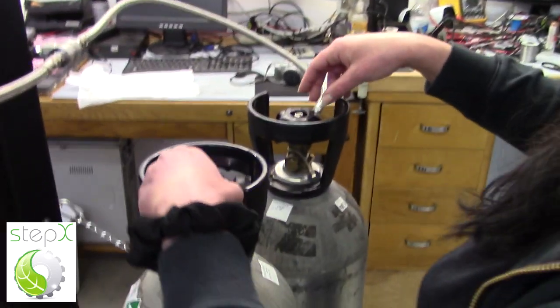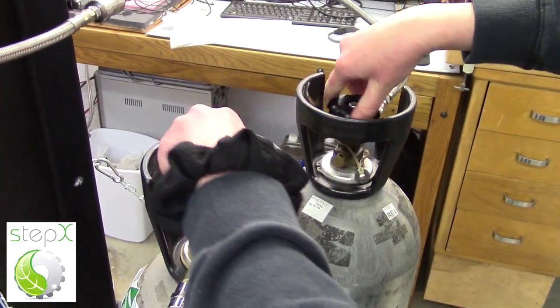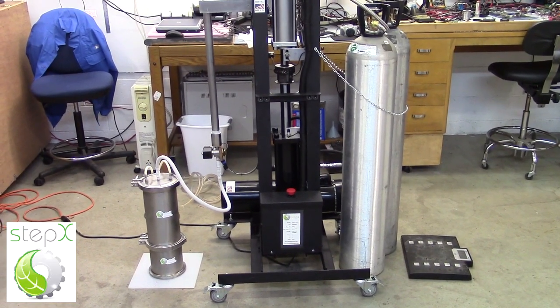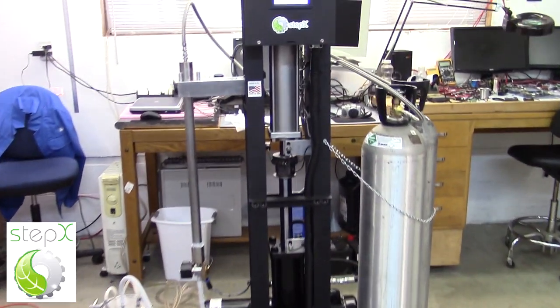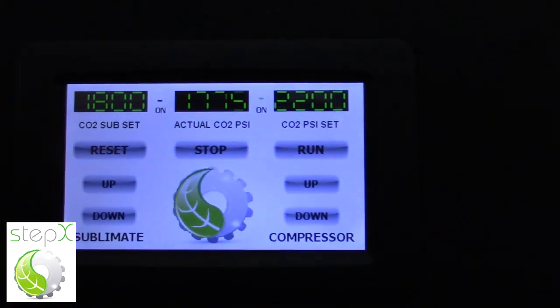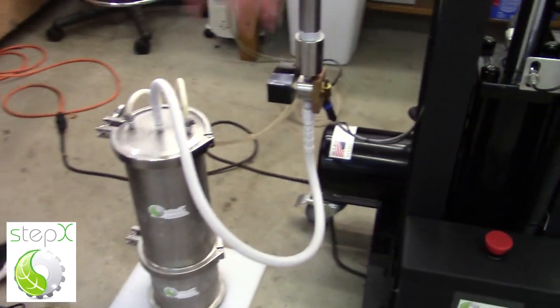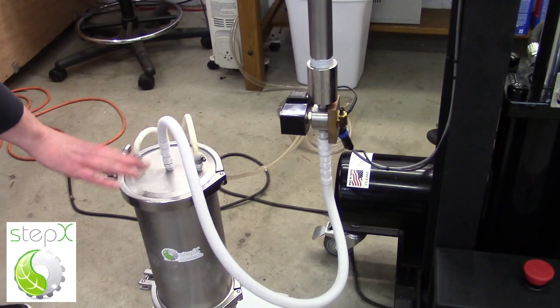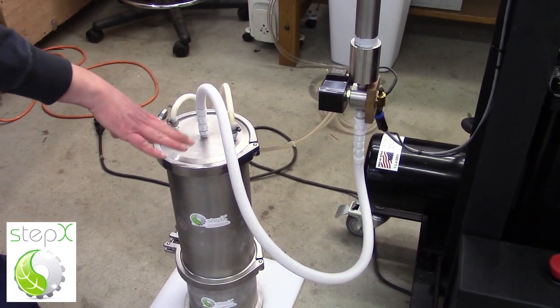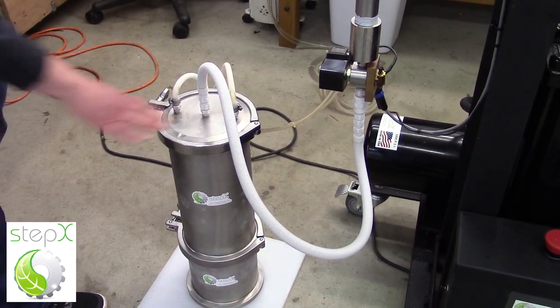Now it's time to turn on the CO2. We have two tanks here. As you can see from the reactor, our lines are frozen here. Our cold trap collector is collecting all the oil that's coming out of our lavender today, and it's retaining more of the terpenes than it would if it weren't cold like this.